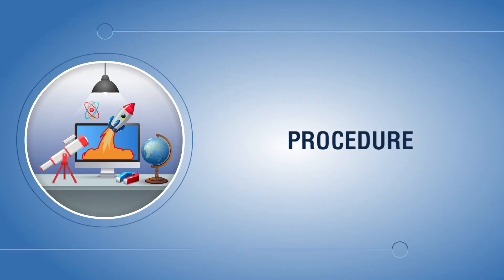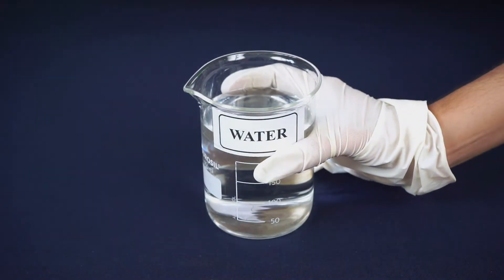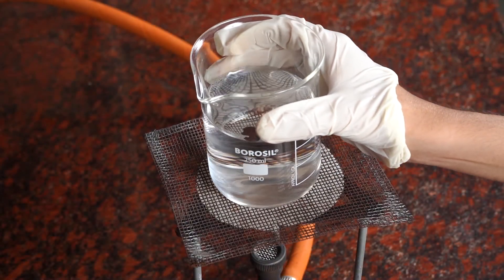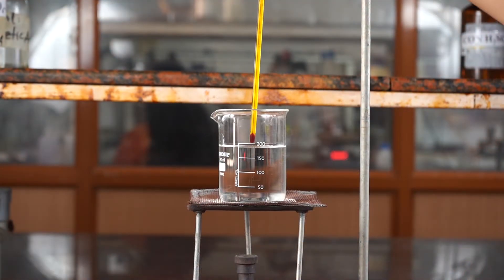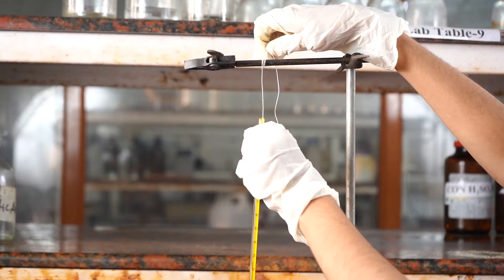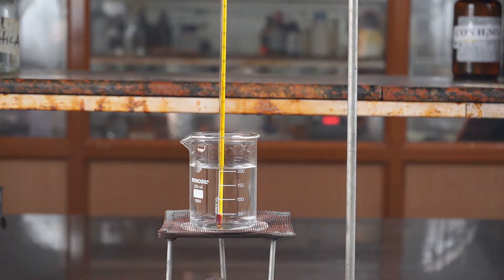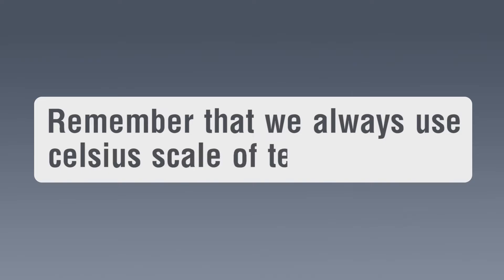Procedure: Take the beaker with water and put it on the Bunsen burner with the help of a tripod stand and wire gauze. Keep the laboratory stand and clamp the laboratory thermometer on it. Remember that we always use the Celsius scale of temperature.